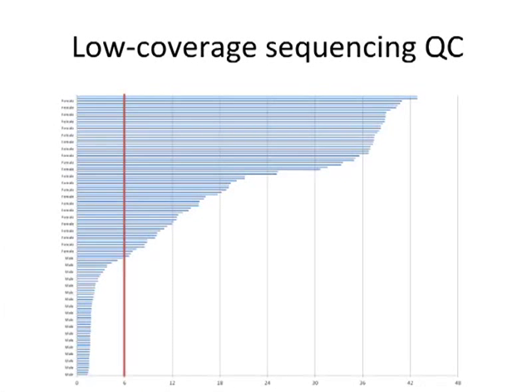A nice sequencing quality control step for mixing samples is using a very simple ratio of X and Y chromosome coverage. Obviously, an XY ratio in females should be very high, and an XY ratio in males should be much lower. You can see that represented here, where we have a line drawn at 6.